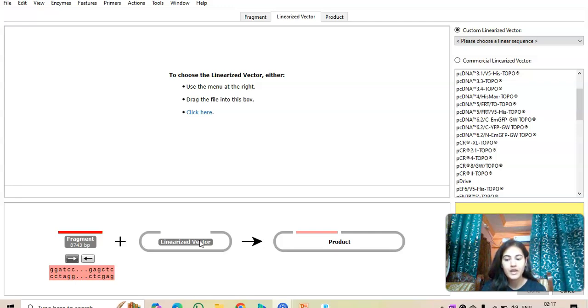And why and how we are going to use it in PCR cloning. If you think about using Taq polymerase in PCR amplification, it generally leaves a 3' A end in PCR products because it frequently dissociates and then associates again, and these replication cycles keep going on. So with PCR cloning, we are going to take advantage of that extra A. We are going to get these T overhang vectors and pair them with this A in the PCR products.